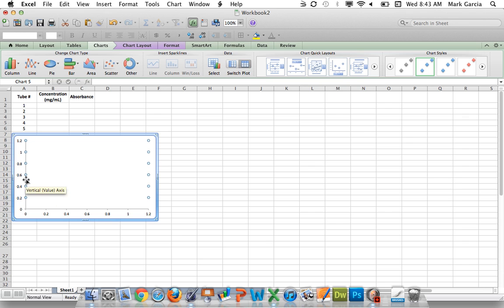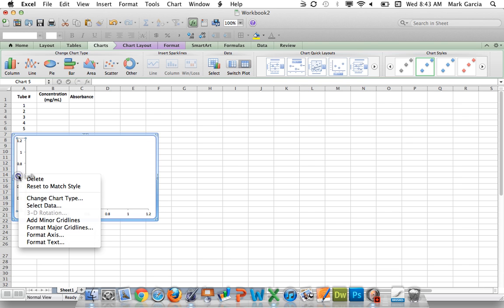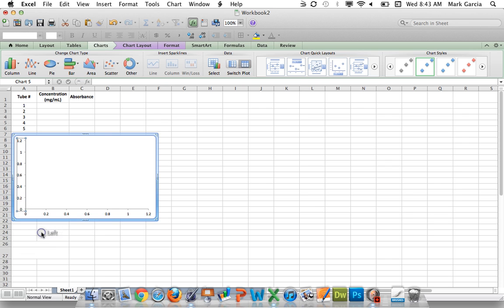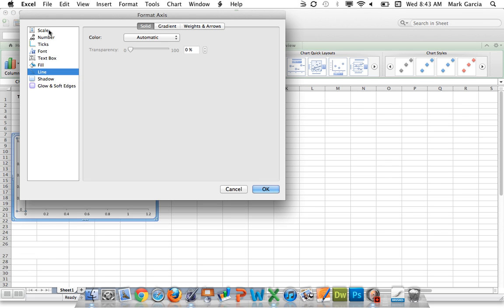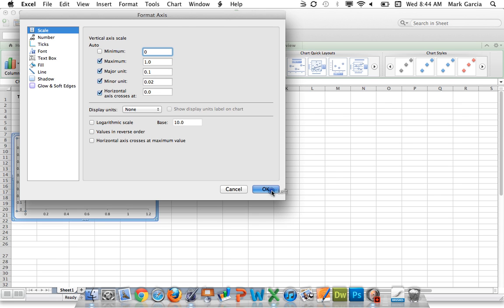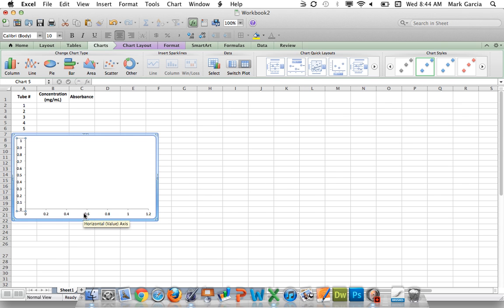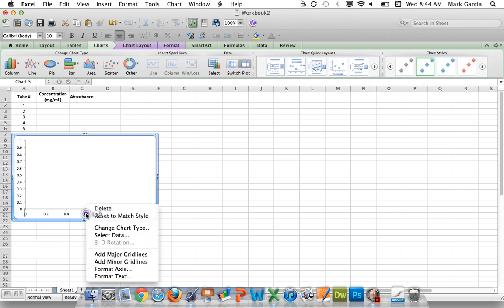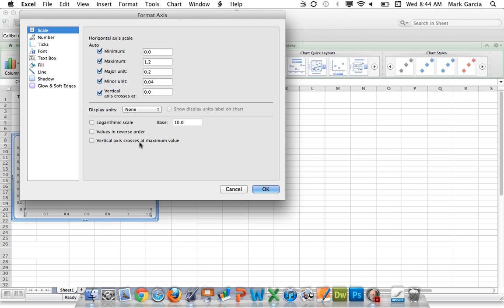I'm going to start by right-clicking on my Y-axis and choosing format axis, and I'm going to select scale. For the minimum value, I'm going to type in zero. Even though it already was listed as 0.0, if this is checkmarked, it's going to auto-correct the scale, and we don't want that. We want our minimum value to be zero because you can't have less than zero absorbance and you can't have less than zero milligrams per milliliter. So I'll click OK. I'm going to do the exact same thing here on my X-axis. Right-click, format axis, and then type zero to remove that checkmark. Click OK.